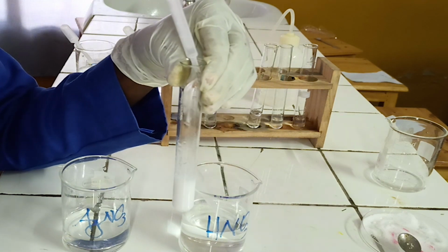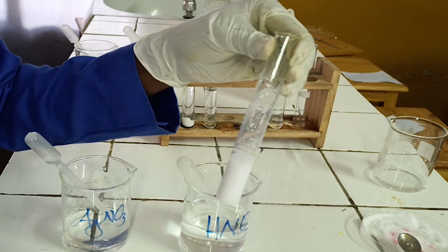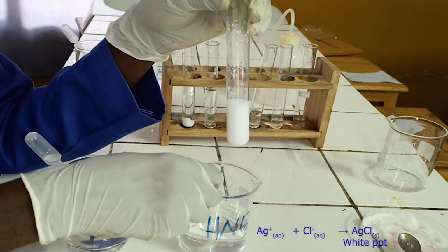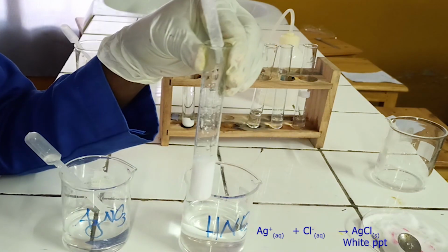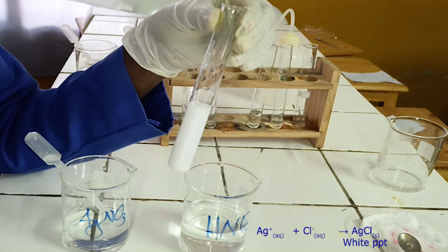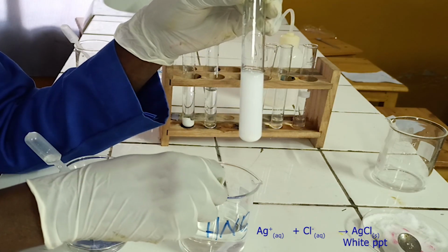As you see, silver nitrate solution reacts with chloride ion to form white precipitate. The precipitate formed is insoluble in diluted nitric acid. Below, there is the ionic equation for this reaction.